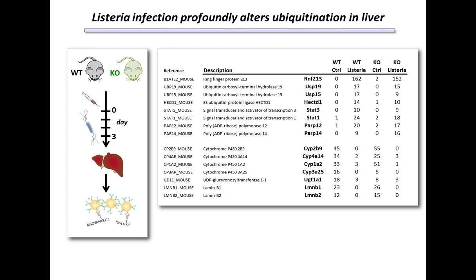For purposes of this talk, it's not so important which of the knockouts it is because they responded equivalently to the infection. But what I'm showing you in the table on the right-hand side are a series of proteins that showed profound increases or decreases in the extent of ubiquitination. In the top section, you can see proteins that are effectively all or none ubiquitinated in hepatocytes that have been infected with Listeria for 3 days, a cluster of proteins in the ubiquitin pathway, regulators of transcription such as STAT1 and STAT3, as well as 2 poly-ADP ribose polymerases or PARPs.